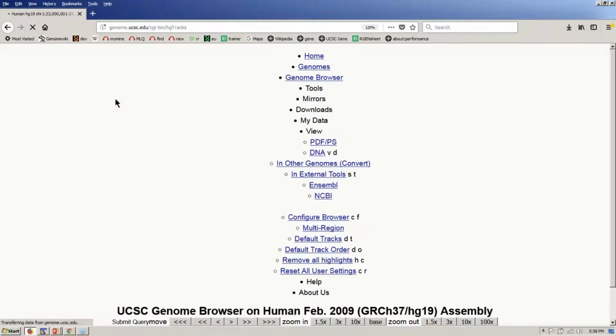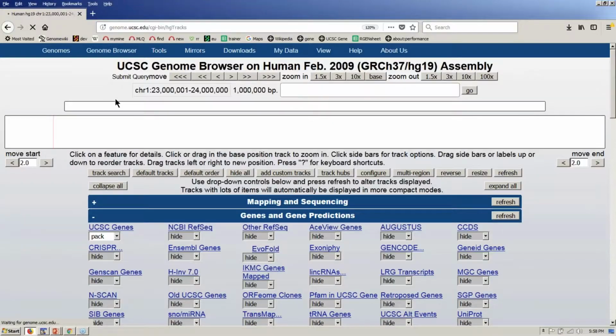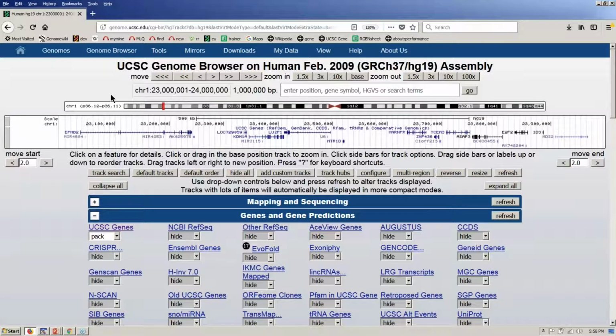And now each one of these genes is being shown with the canonical transcript, which is our representation of, typically, the best annotated one from RefSeq. It's the one that they call validated, so it's the one that has the best amino acid sequence and the best transcript. Other data tracks that we have, and as you could see when we scrolled down before, there are many.